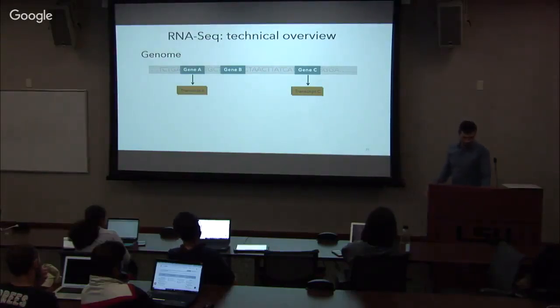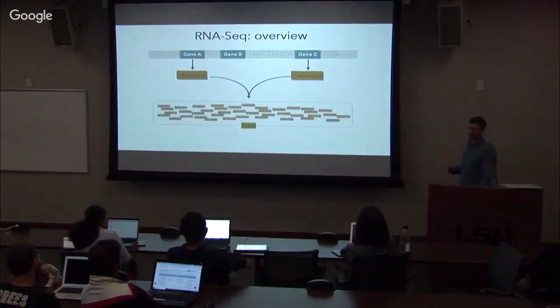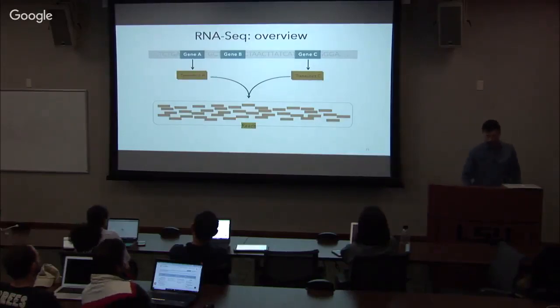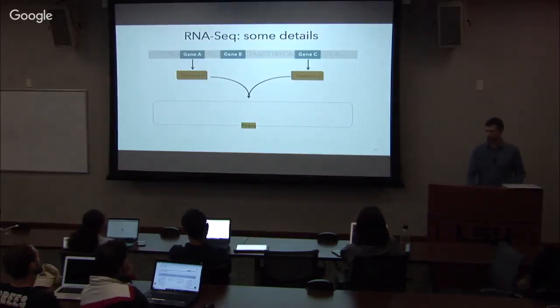And now what we're interested to do is look at the shattered reads, right? So these portions have been found in these short reads. But in reality, this is a little bit more complex, right? In the preparation, what happens is we have shattering first.